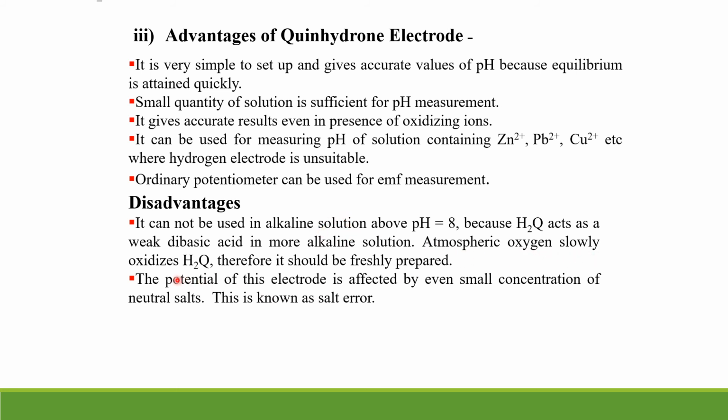Atmospheric oxygen slowly oxidizes H2Q, that is hydroquinone, and therefore the hydroquinone should be freshly prepared. The potential of this electrode is affected by even small concentrations of neutral salts, because if neutral salts are there, then the salt error will come up.